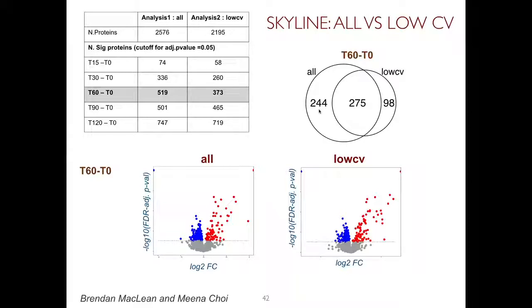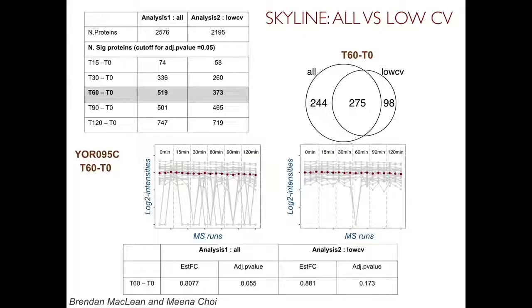And so we think that possibly this can be a false positive. If we look at the volcano plots, they look kind of similar, right? There's really not much difference, but there is a disagreement between these two parts. So what we can do then is look at some of the individual proteins. These are again the profile plots. You will see a lot of them as part of MSstats.